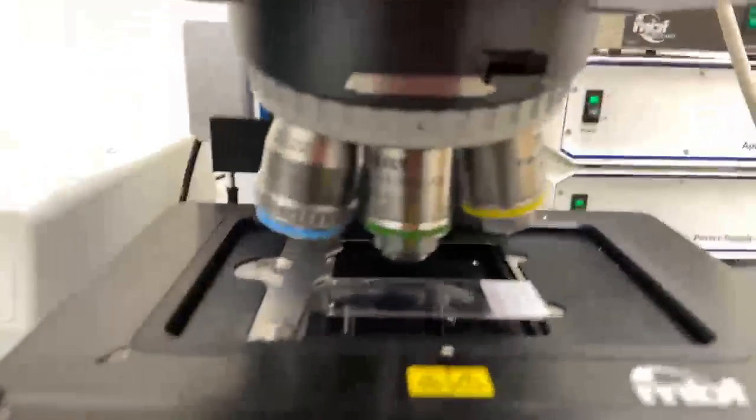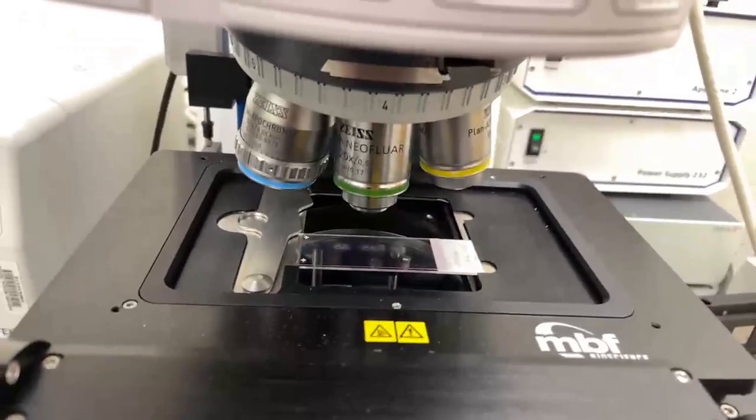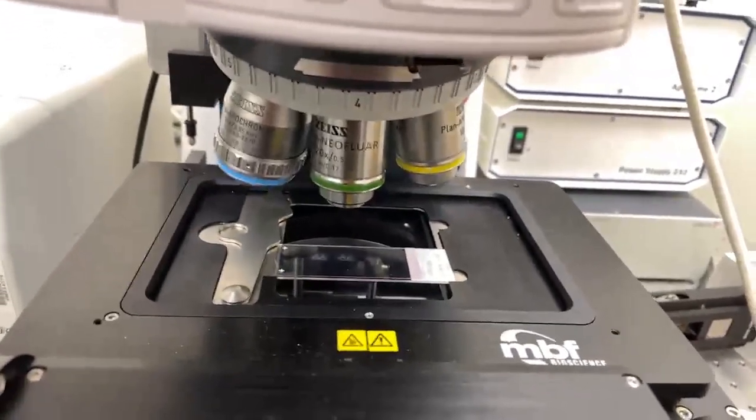Also, if you work in a lab and you're doing microscopy, don't leave the laser on, because like every other light bulb, it'll eventually burn out and then you have to spend a lot of money to fix it. Let's turn that off for now. Yeah, and like this, there's just nothing. Oh, many thousands.